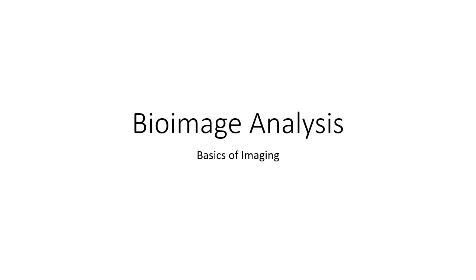So this is my second talk for the day on this course. This time we're discussing the very basics of imaging. So what should you do with different kinds of microscopes to make sure that your data is as good as possible.